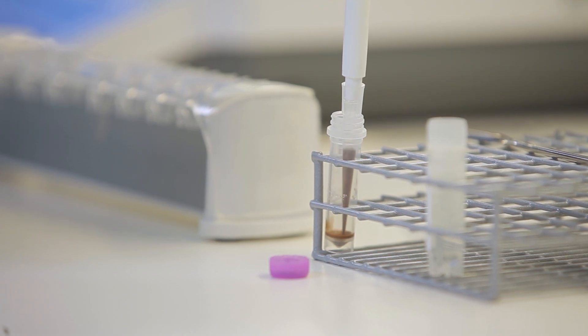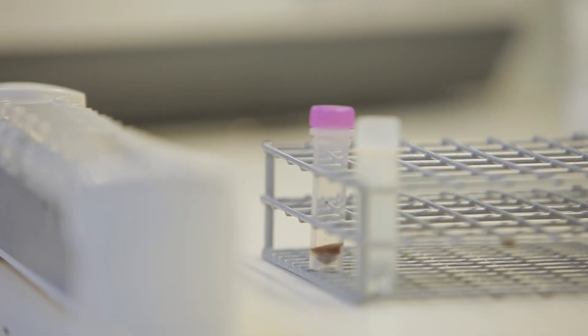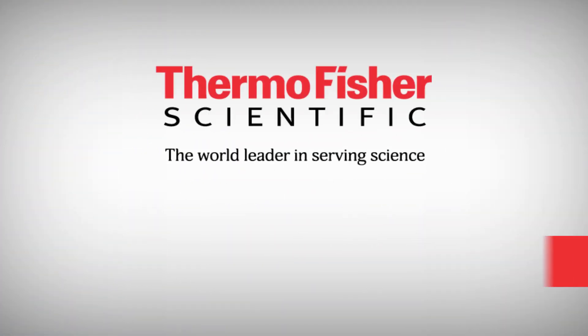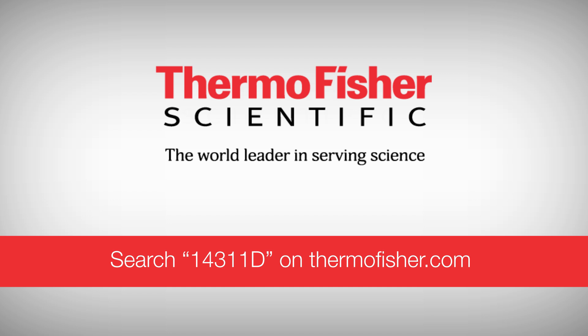Resuspend the beads to a final concentration of 10 mg per mL. It's that simple. Visit ThermoFisher.com and search 14311D for your antibody coupling kit.